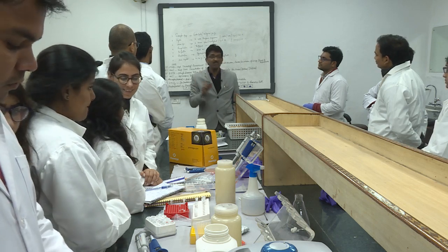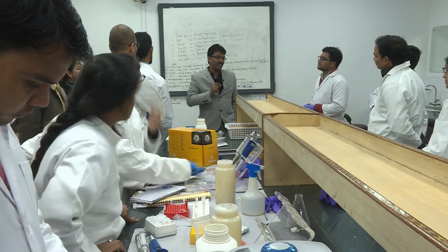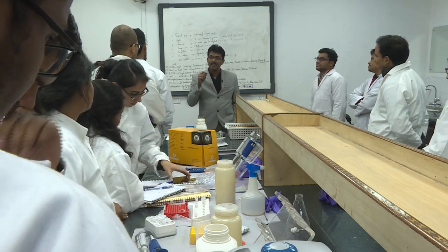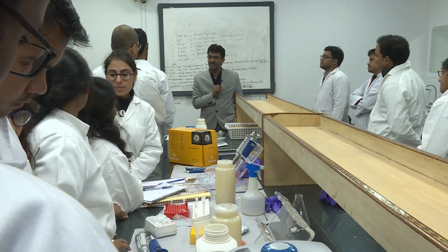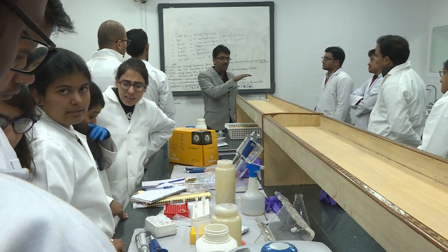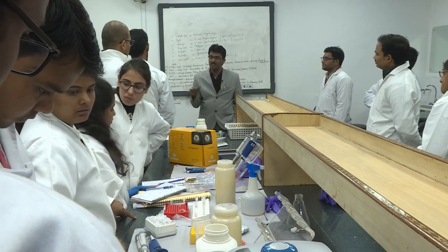Okay. That is what I am telling, the sample preparation is the most difficult, especially in the case of microorganisms, whether it is fungi or bacteria. The sample preparation is the key for successful DNA isolation, right. So, morning also I highlighted, you have to harmonize, you have to have a uniform quantity of the starting material across your samples.